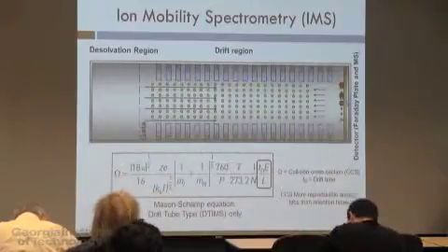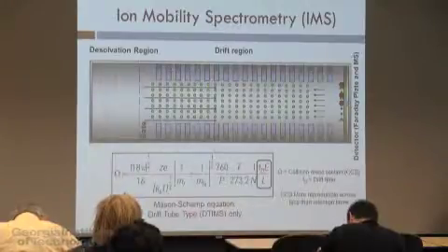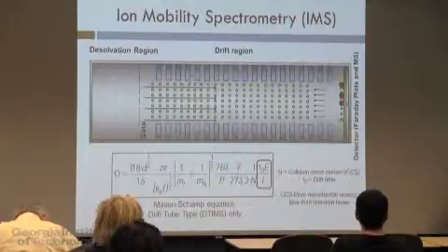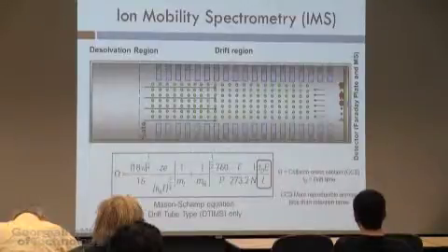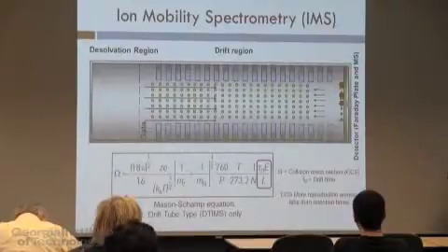By the way, these instruments, this is called a drift tube ion mobility spectrometer. These were developed back in the 60s at Georgia Tech in physics. Okay, and then they made it all around the world, and they're even commercial. Okay, but the theory for this is what's called the Mason-Schamp equation. The collisional cross-section of an ion, omega, is basically proportional to the drift time in this tube, proportional to the electric field in that tube. So this is like an electrophoresis, and it's inversely proportional to the length, right? So the E over L is really what matters. So we're trying to find ways of using omega as an additional parameter for identifying metabolites.